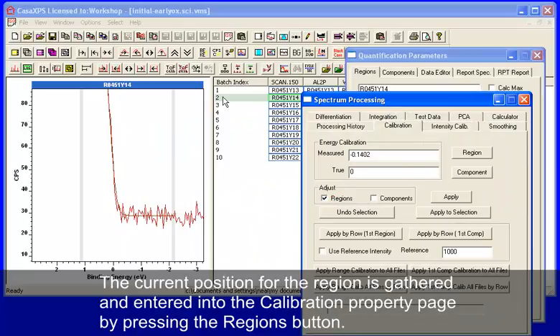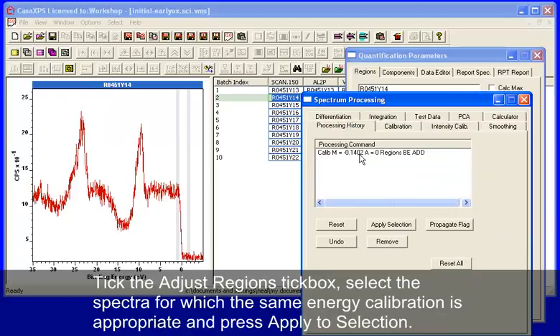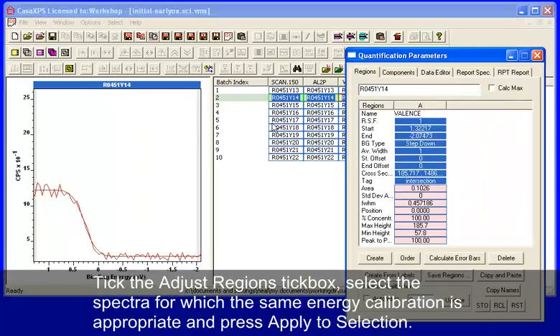We'll then calibrate the row using apply to selection, so we've now calibrated a whole row of spectra based on this Fermi edge.